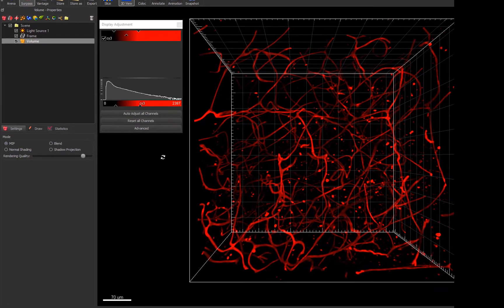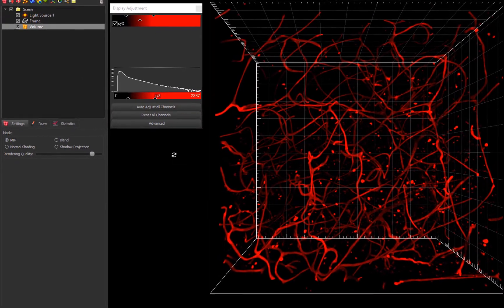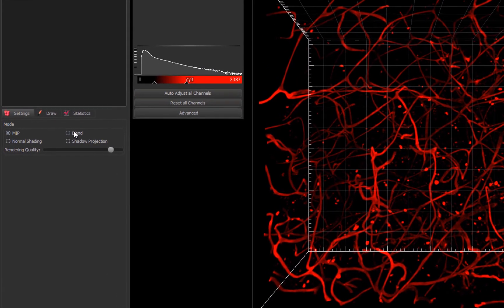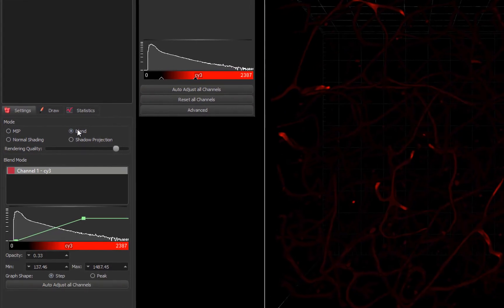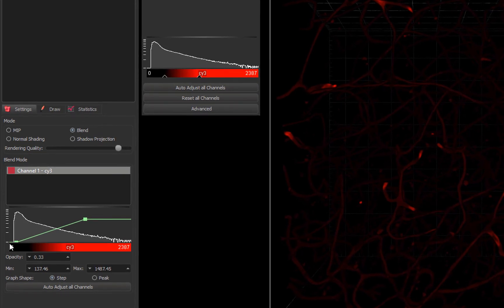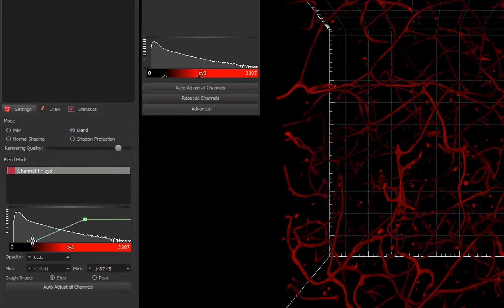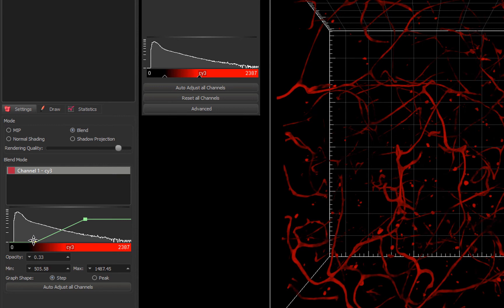Now, within Elmaris, I'll show you how to interact with the transfer function. First, click on Blend in the Volume Settings tab, then click on the left-hand, or minimum, control point. By moving it to the right, I make transparent the low-intensity voxels that are blocking the view of the higher-intensity voxels.